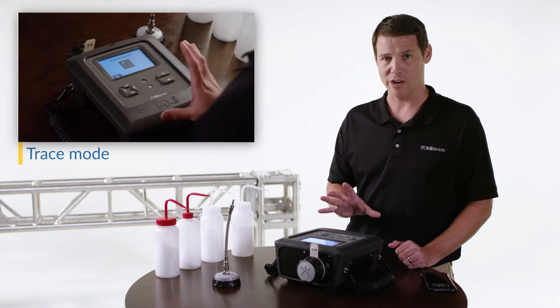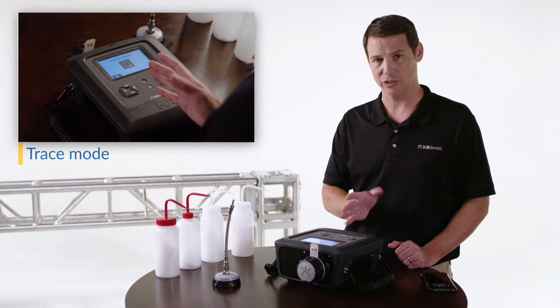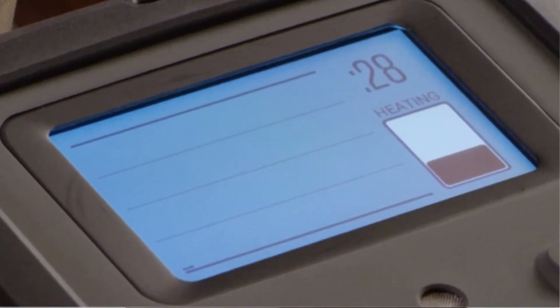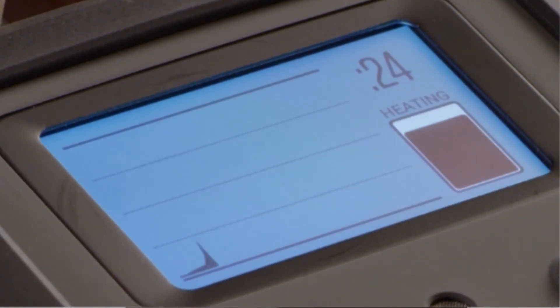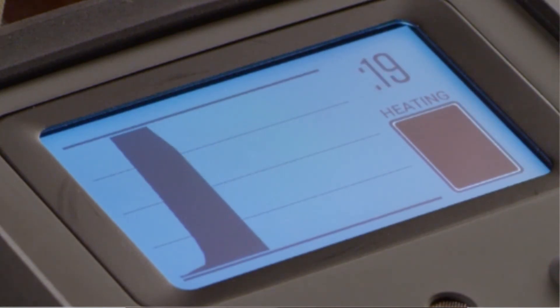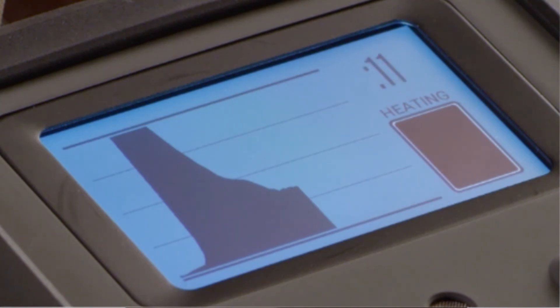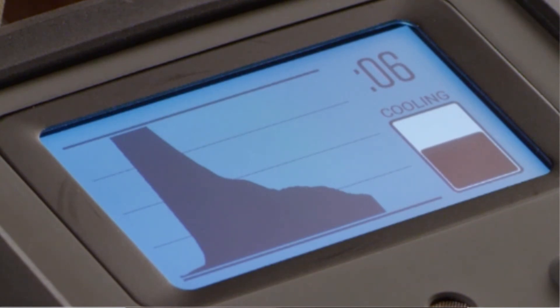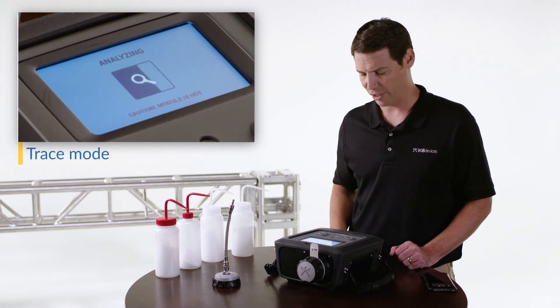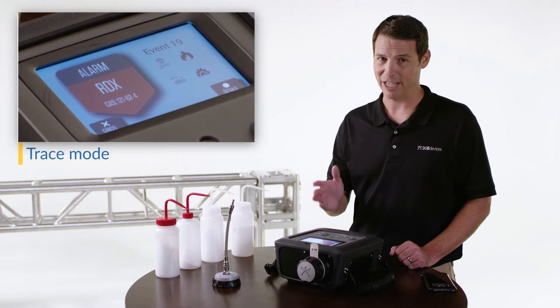During analysis we will see an indication of signal throughout. We see the screen telling us heating has begun and a nice strong signal. Most of that signal has now burned off the suspicious swab and we're going to begin the cool-down phase. In just a few seconds analysis will complete and we'll see an answer. In this case the answer was RDX.